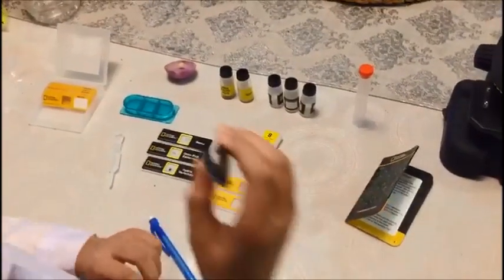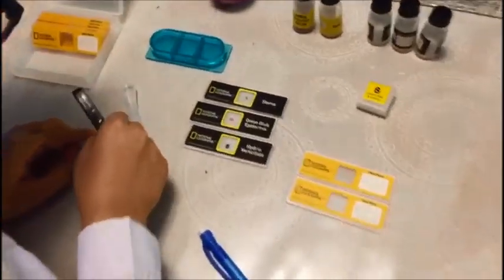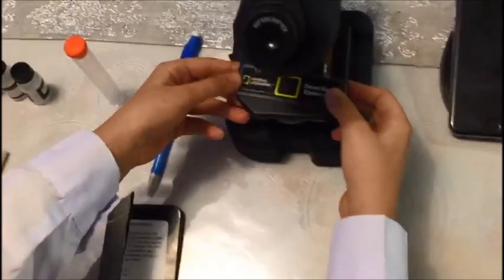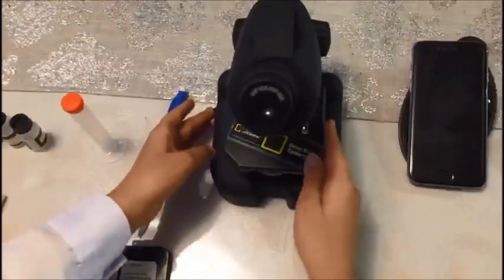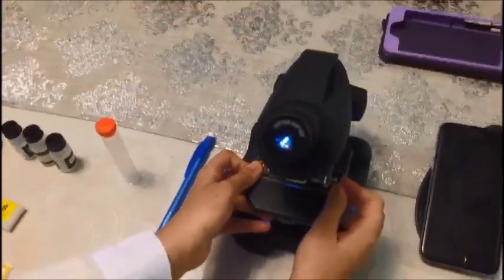First I take my tweezers and pick up the real thing, and then I put it on this. And squeeze one droplet to make it more. Now I am going to show you how to put it in a slide. First we are going to put this fake onion bulb epidermis — you put it in like that. First turn it on so you have some target of where to put it, and then put it exactly under that.